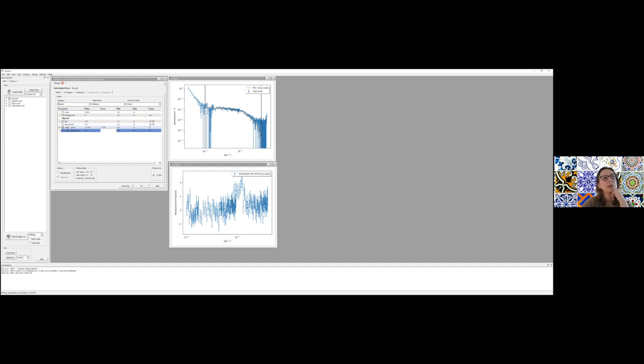Now, one thing to be careful of when you're doing these fits is that these parameters are often correlated. You can see that SasView actually separates the scale and the background from your very specific model parameters. And remember that magic formula for the intensity, you have your volume fraction, so your scale in this case is being multiplied by your form factor and your structure factor. So if you change the scale and you change one of these parameters at the same time, they're correlated, so you can bias your results. So you don't want to fit too many parameters at the same time. You can, for example, untick the polar radius here and fit your background and let it find more appropriate values. So that looks a little bit better.